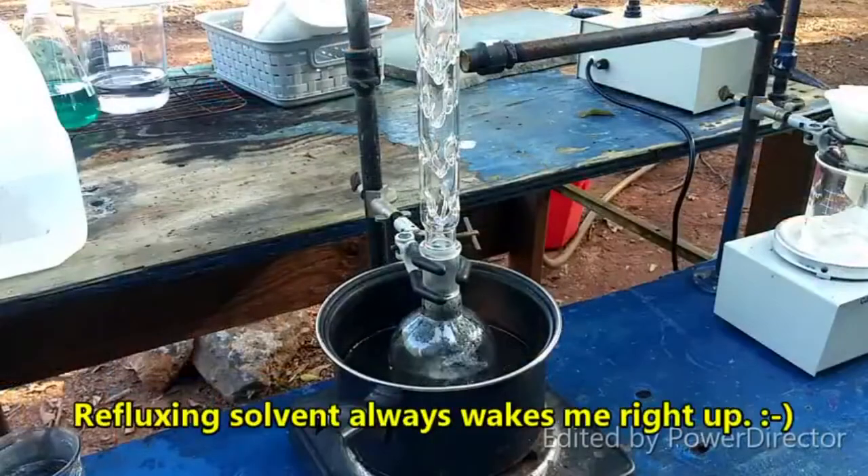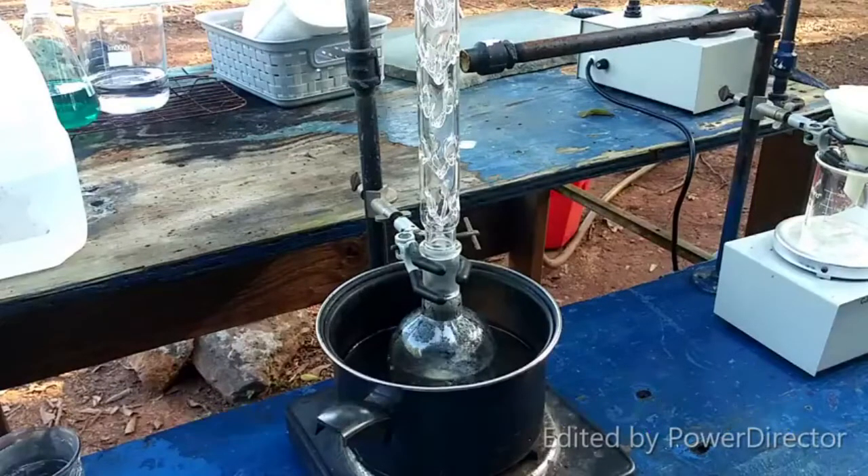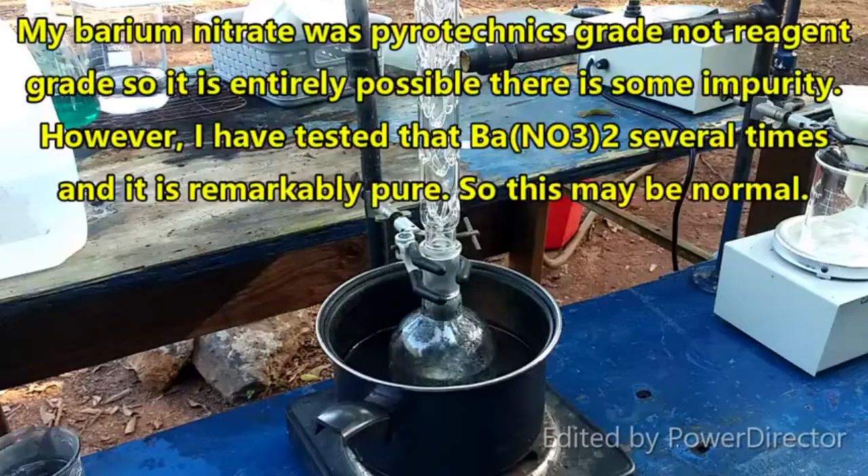This stuff has been refluxing for a little more than half an hour — I gave it some extra time. There's still a good bit of yellow residue at the bottom, which is a little discouraging, but whatever. We'll try filtering this and see what we get.